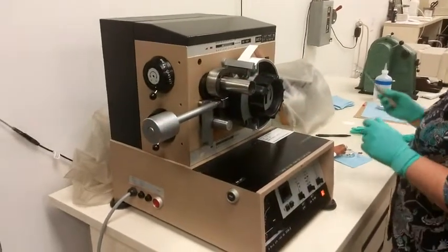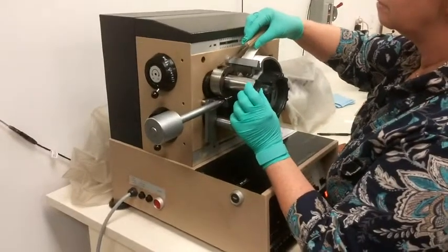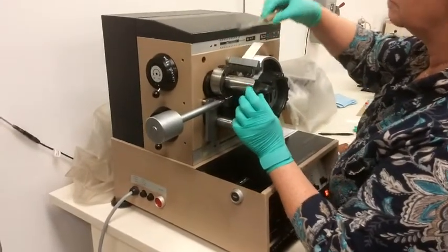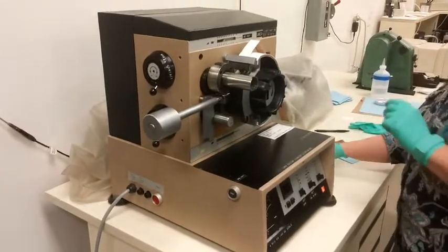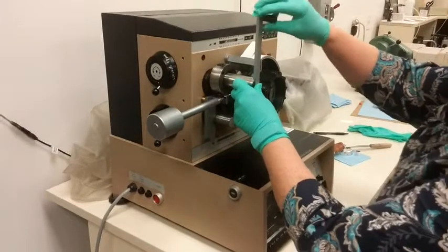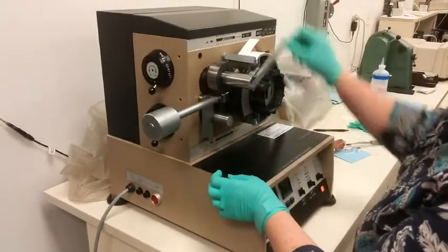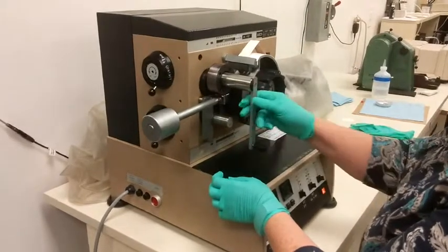The oil is transferred to the surface of the substrate while under acceleration. Typically, the speed increases from 0 to 4 meters per second during application. The oil creates a pulling action on the paper surface, like offset ink, resulting in picking, blistering, or both.